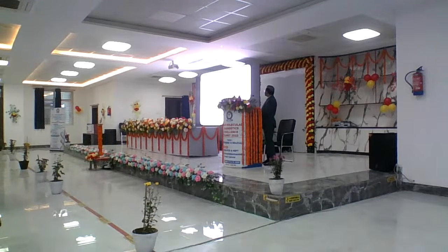Next slide, intermediate concentration, where in some cases a droplet can have up to 3 or 4 target DNA copies. Like, assume 5,000 targets in 20,000 droplets. Mathematically, 75% of the droplets should be empty, but as per Poisson's distribution, it's not 75, it's 78%, because some of the droplets might be containing more than one.